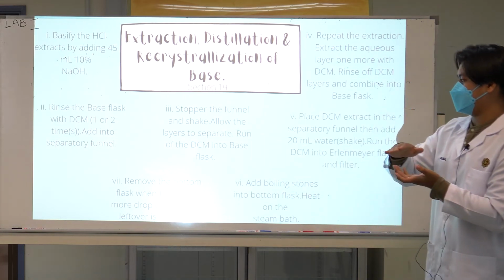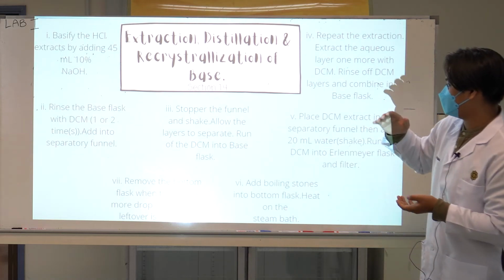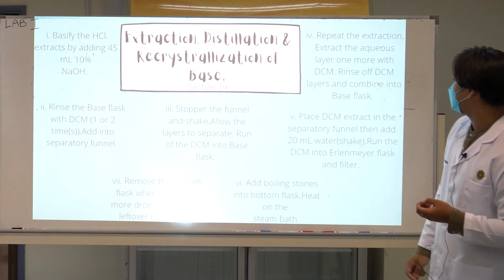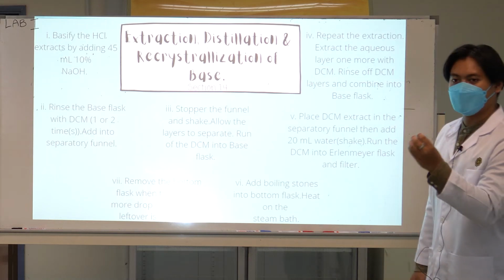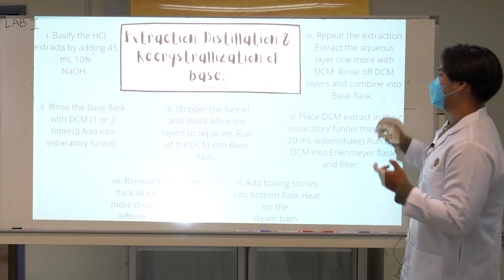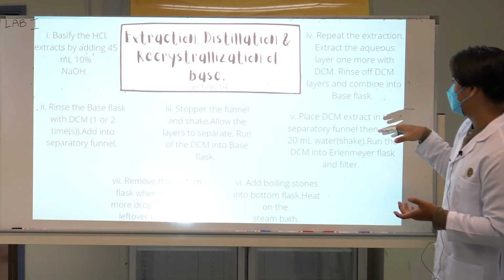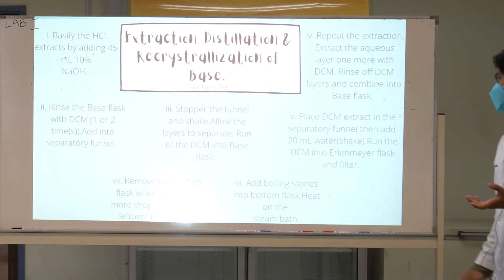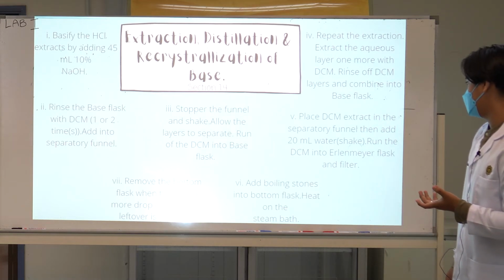The DCM layer will be at the bottom, and at the top we have aqueous, I think. Yes. Then we repeat the extraction using DCM, and combine the previous DCM with the new one.